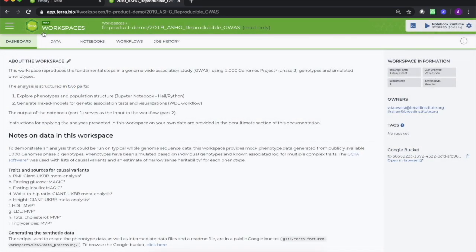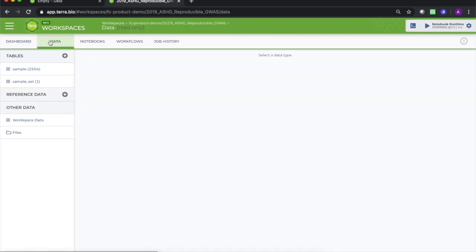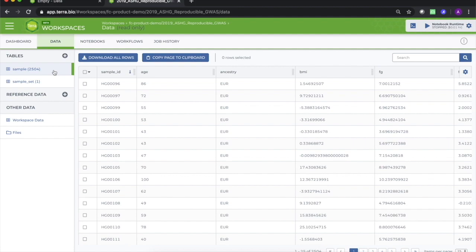To download a table, navigate to the data tab of the workspace that contains the desired data, select the table of interest, and within that table select the rows you want to include in your TSV file. All of the columns will be selected automatically. Then click the three dot button and select the download as TSV option.